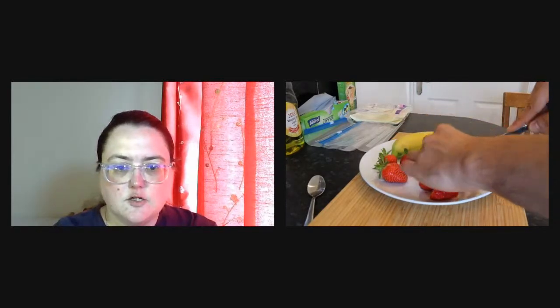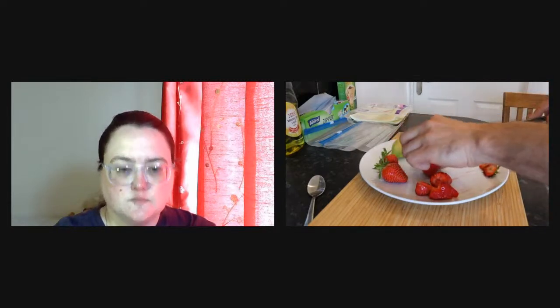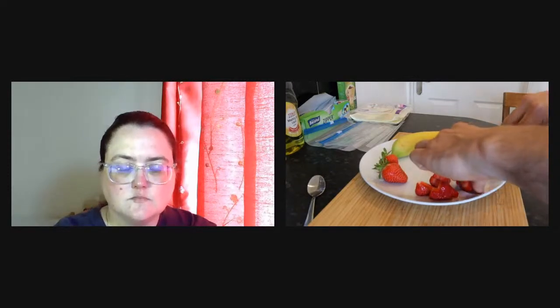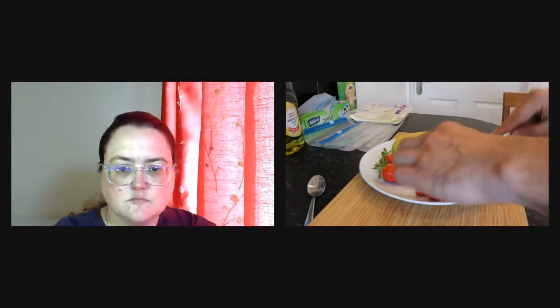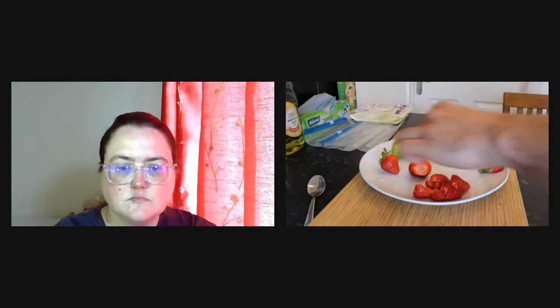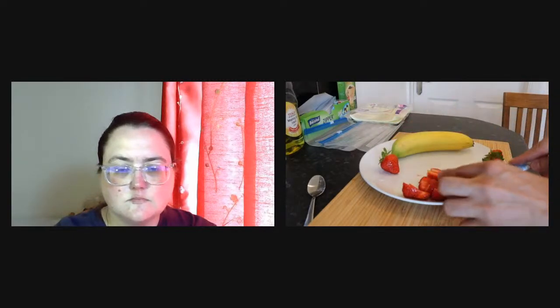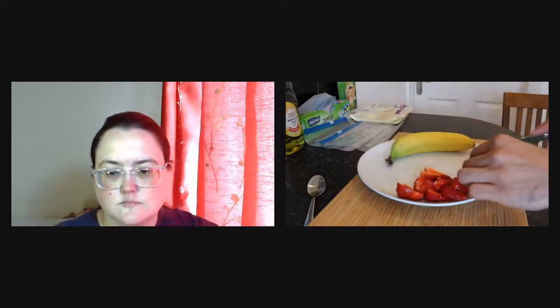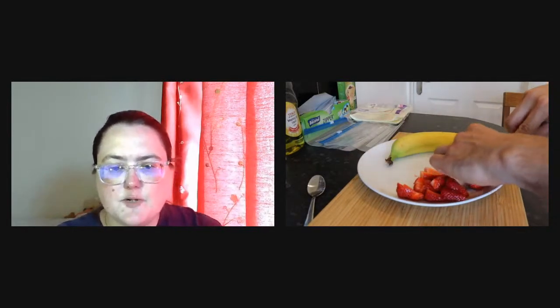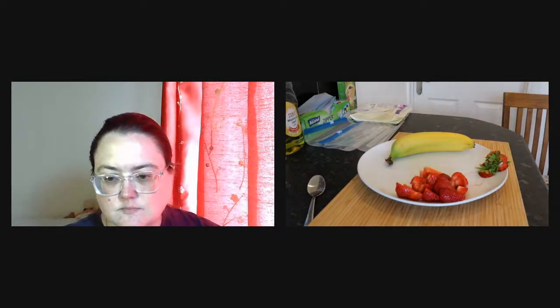So you take off the green bit and cut up everything else? Yes. When I started for today's experiment, I think I had 5 strawberries. That's a good amount to have good extraction. They are not the biggest of the strawberries, just normal ones. At the moment, I'm just cutting the strawberry in pieces, nothing complicated. Because they're quite small, you'd say 5, but if they were a bit bigger, maybe a couple less? Yeah, probably 2 or 3 would be good.